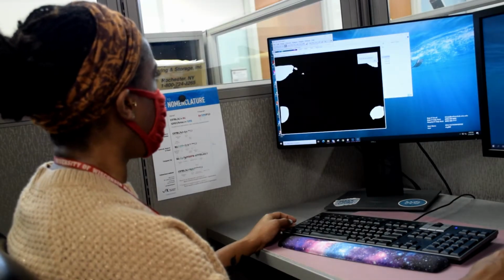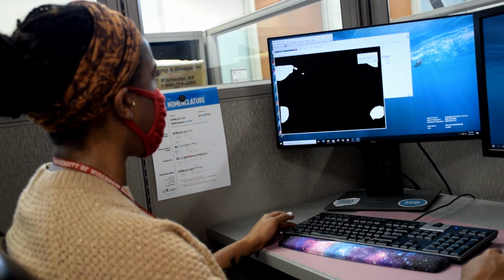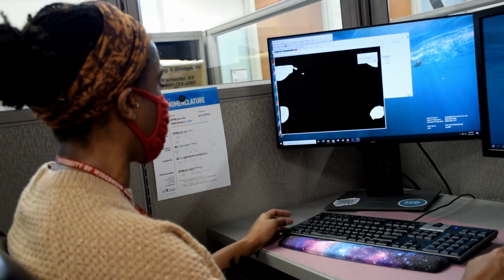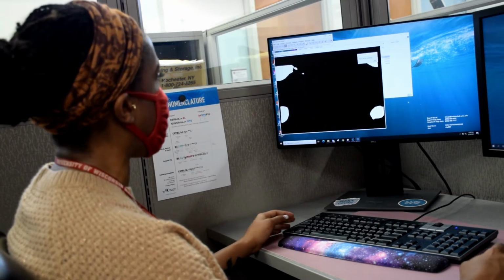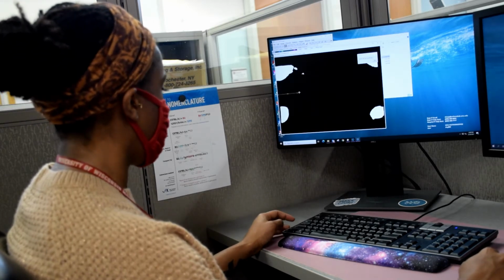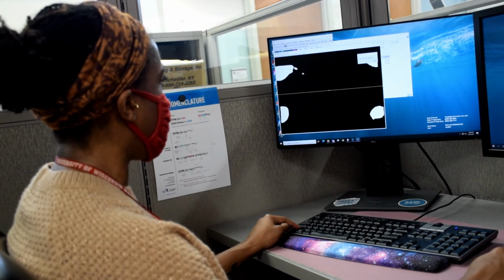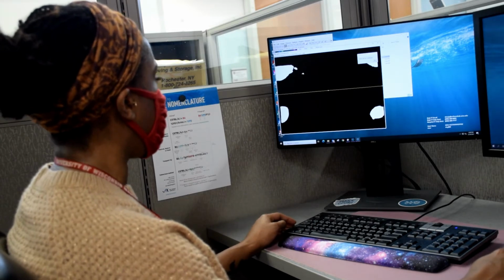Alright, now that we have our image of the filter paper color corrected so that our urine spots are white with the black background for perfect contrast, we are now going to crop this image for further analysis. So selecting our cropping tool plug-in, we're going to draw a line right across the center of the image. Hold down our shift key so that we have a nice straight line. And we click OK to continue.